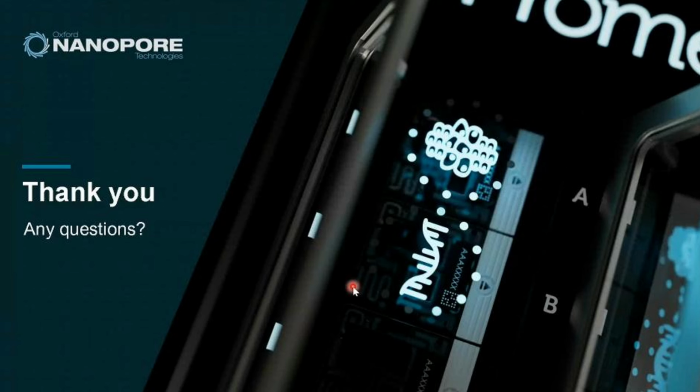Again, it depends on the purpose, meaning what you expect to get from the sequencing result. If you just want to know the identity, you can perform a targeted approach, let's say using a universal primer for amplifying your bacteria of interest or even yeast or some organism that you're interested in.